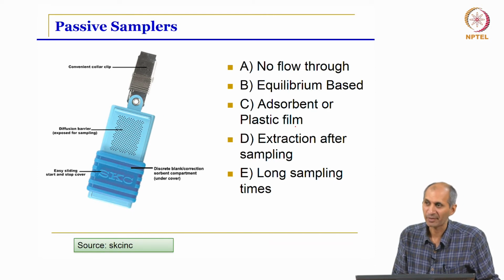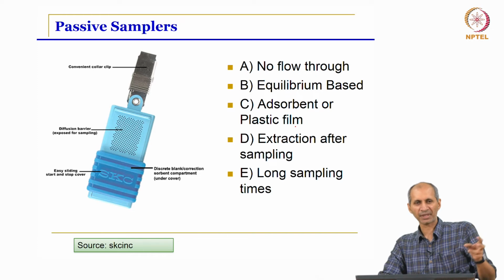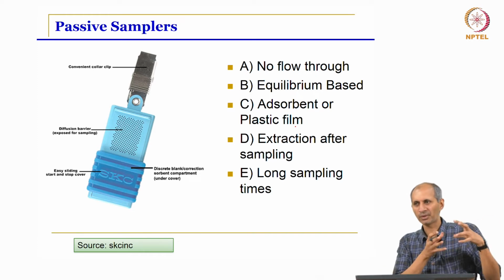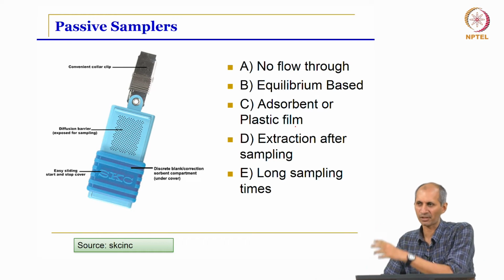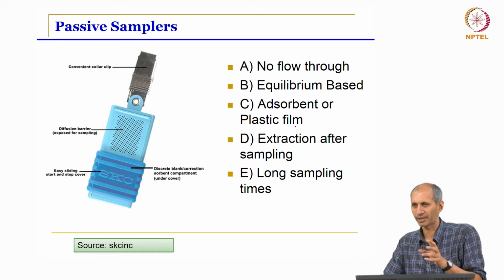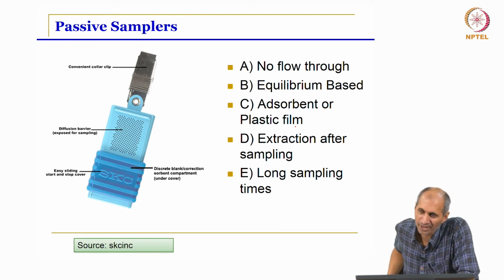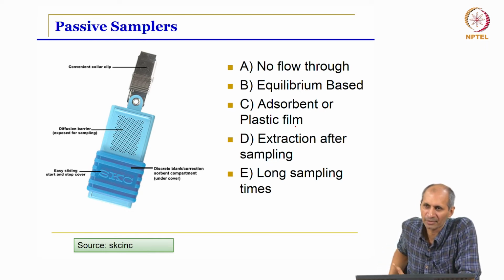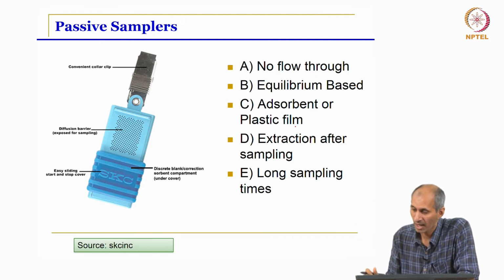This is an equilibrium based sampler, which means that in all the other things what we have done is we take a sample of air, we know the volume of air, and we extract whatever is there, and that way we exactly get the concentration, mass by volume. Here, in some cases, for example, if you want to take ambient air samples in the way we described just now, that is what is called active sampling.